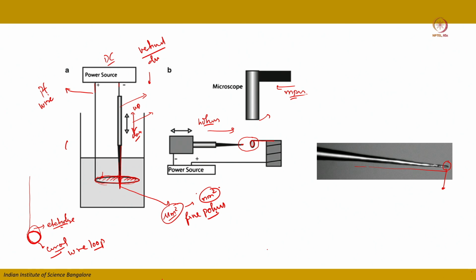Okay, sometimes, as this is a destructive technique, with the field evaporation, once your tip surface becomes fractured or the voltage has increased enough that the tip becomes blunt, then this final polishing method can also be used to make this particular tip sharp enough for further analysis.